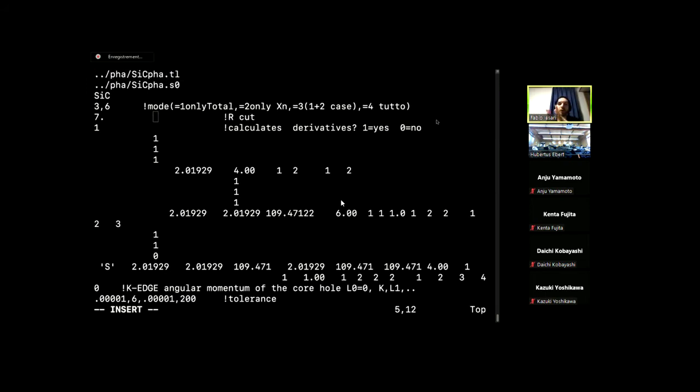Let's say it's a smart way to move the structural parameter and recalculate the signal without needing to recalculate the signal ab initio. This works if your initial guess of the structural parameter is not far from the real one, but in case your initial guess is wrong, it's better to recalculate the actual signal.